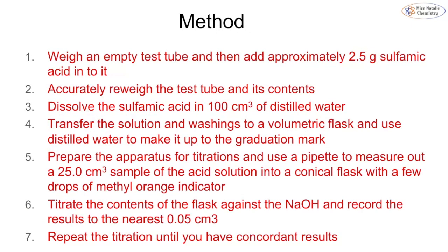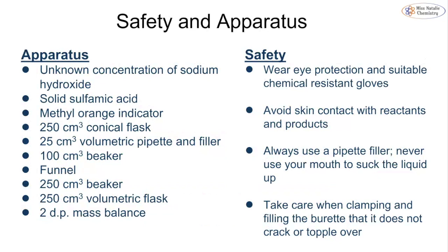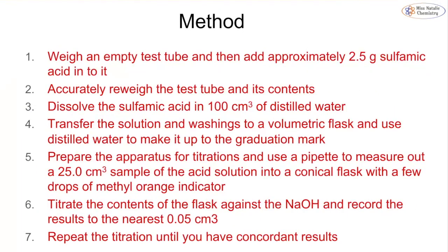The first thing that we have to do, let's just look at our safety and our apparatus. So we have our unknown concentration of sodium hydroxide. We're going to be using sulfamic acid as our standard solution, and this time we're going to be using a methyl orange indicator. We have all of the same apparatus as our titrations. The only difference is we need to add in our balance. We have the same safety as we had in the last core practical, making sure to wear goggles, gloves, always use a pipette filler, and take care not to smash anything.